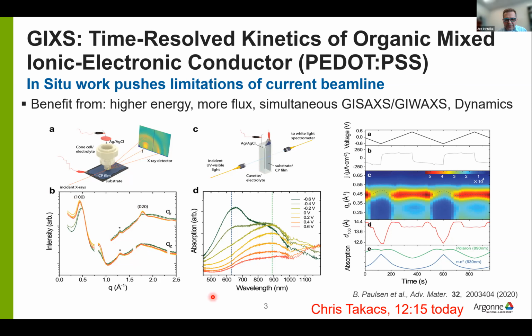These changes also manifest themselves in the UV-Vis absorption spectroscopy that you see in the middle panel. On the right, as a function of the applied potential, you measure the change in the current in situ. This is focusing on that first lamellar peak in the structure, looking at the intensity as a function of time and seeing how the d-spacing changes as the material is doped and de-doped. Similar changes can be followed with the absorption spectroscopy.